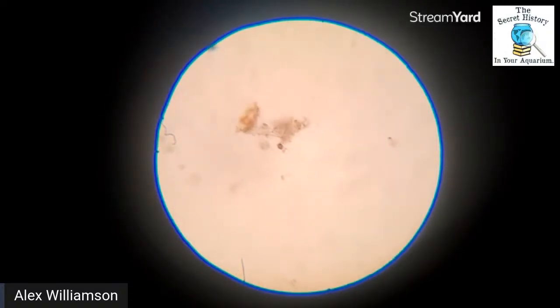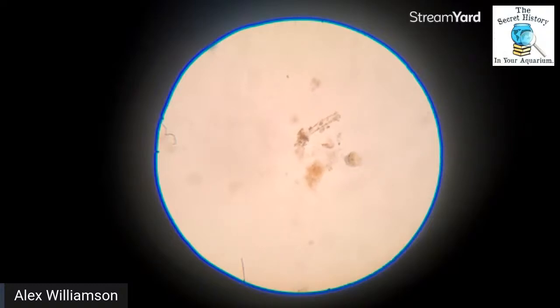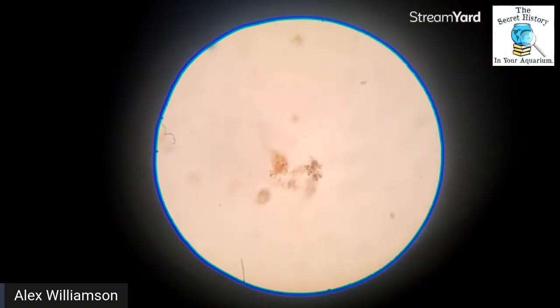Let's see what's going on here. What is this thing doing? It's caught on some algae or something. You can see how strong it is, and you can actually see that in its stomach, those little brown guys that are swirling around in circles, they're actually in its stomach too. If you take a look at it, I'll stop moving again, but look at that. It's got a very clear mouth and graspers. I don't know if you guys can make that out on the live stream, but it's kind of shaped like a circle with a mouth, and it must have a tail like a little sperm would, because it's caught up on that stuff, and I see that its body's not touching that mold that it's caught on.